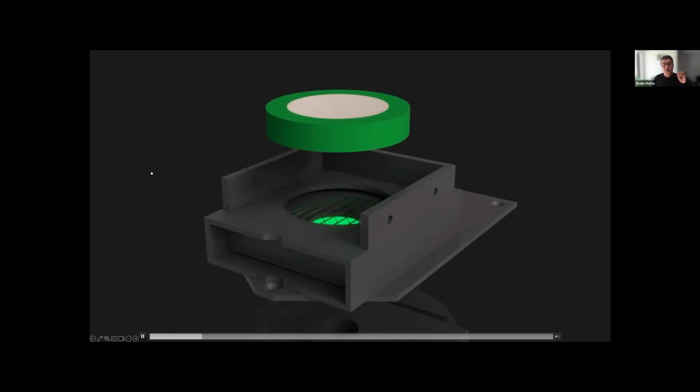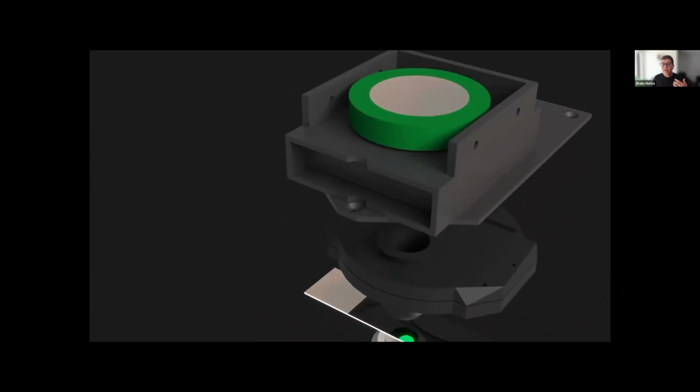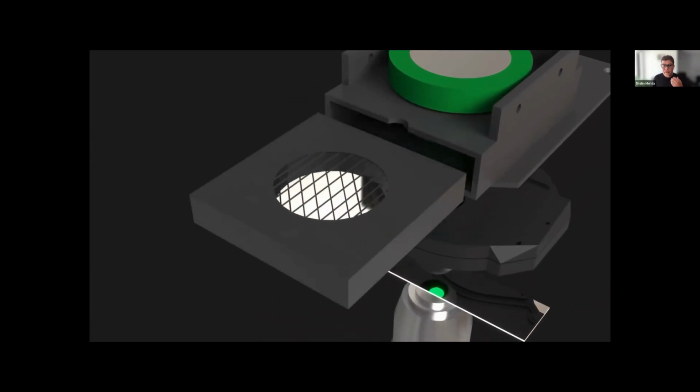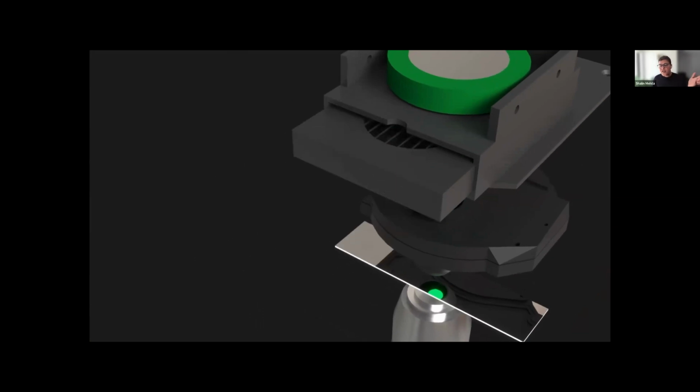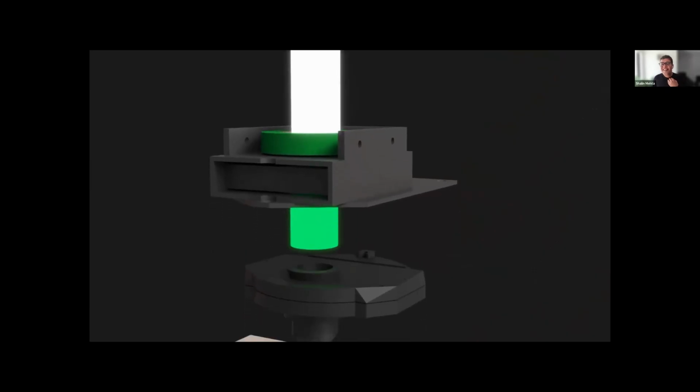I'll just show this cartoon to illustrate that this idea applies not just to phase imaging, but also to polarization imaging. WaveOrder is a vectorial wave optical framework, not just a scalar framework. This animation is done by my son, who was inspired by Lucky to take up Blender.